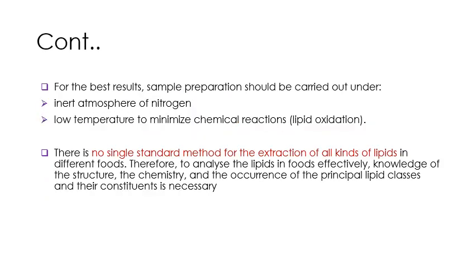For best results, when you prepare your sample for lipid analysis, you should carry it out in an inert atmosphere or nitrogen, as well as at low temperature, in order to minimize any chemical reactions, particularly lipid oxidation. Unfortunately, there's no single standard method to extract all kinds of lipid. Again, it depends on your knowledge of the structure, chemistry, and occurrence of the principal lipid classes and their constituents in the food.